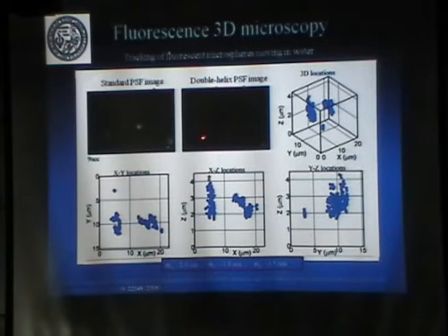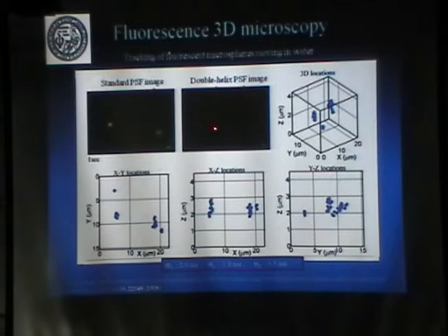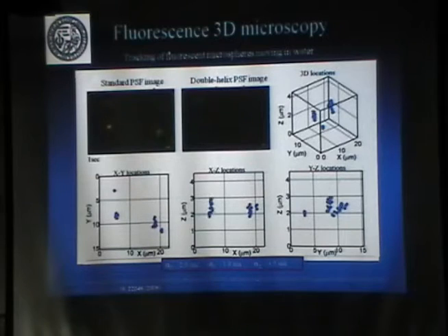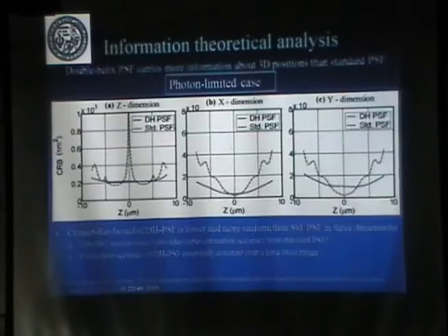There. And here you see the double helices moving. So regular double helix. Of course, because here you're splitting the light into two lobes, the intensity is going to be lower, but that's still not a problem. And then you can track the location of these particles as well.